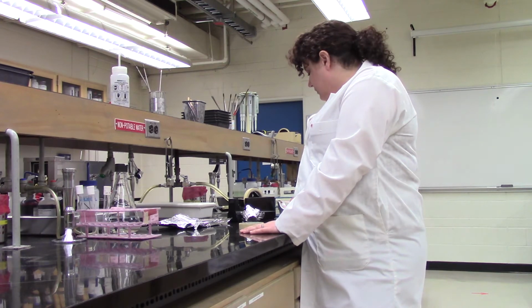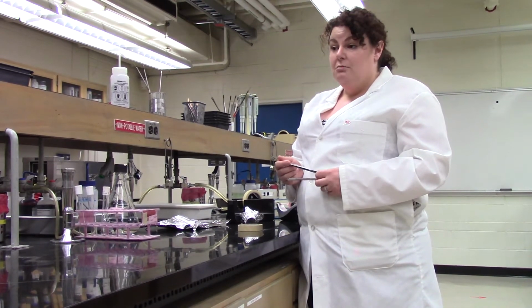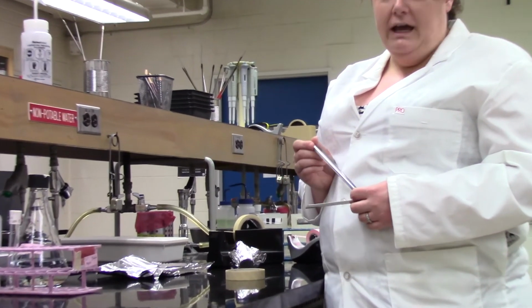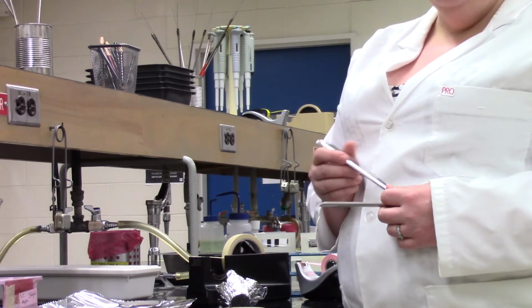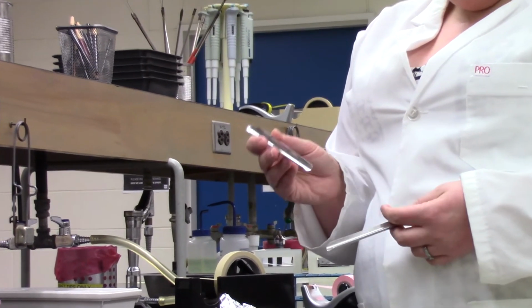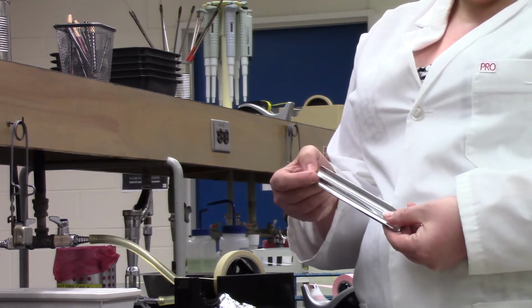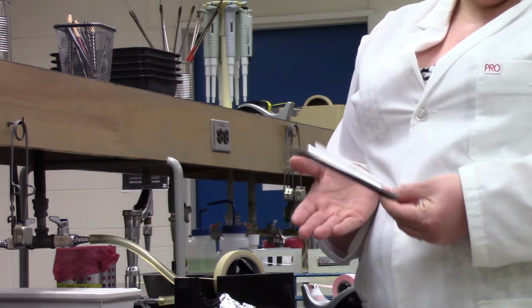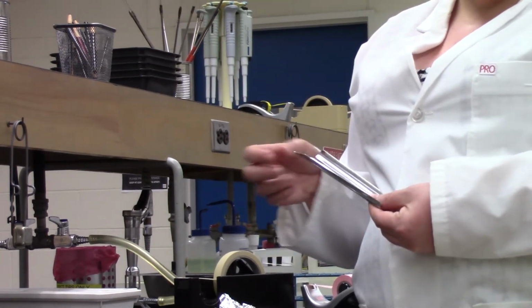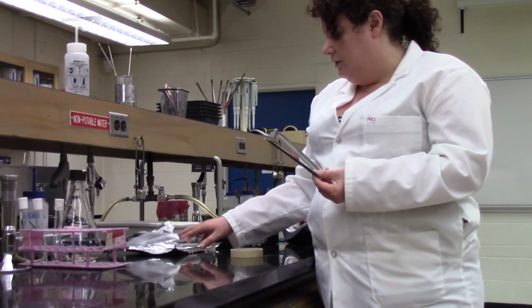Now every so often, you might want to autoclave something solid. So for an example, you might be needing to measure out something like yogurt, a food product that has microbes in it, and you don't want any extra microbes interfering with what might be in your sample. So for that, you would want to autoclave these solid items. Now, these spatulas here could safely go into the autoclave just like this. However, if that happened, as soon as I open up the autoclave, these are again exposed to all the microbes in the air. So because of that, we want to wrap them.